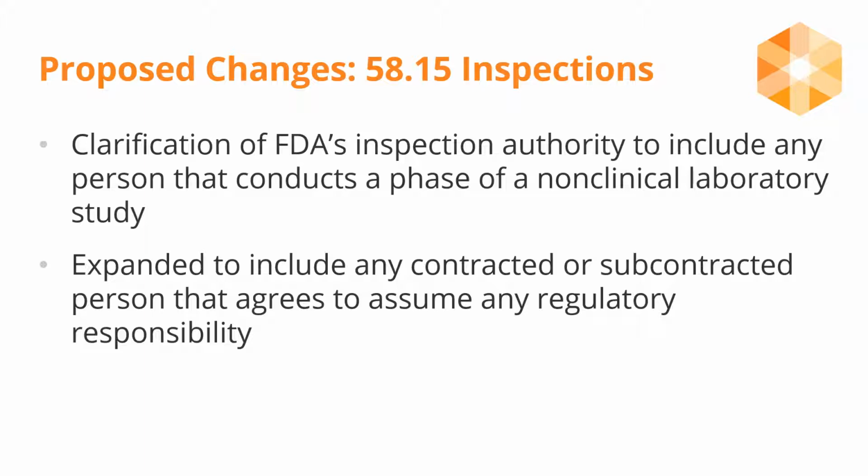The FDA clarifies their inspection authority to include any person that conducts a phase of a non-clinical laboratory study. And the update expands the realm of regulatory responsibility to include contractors and subcontractors.